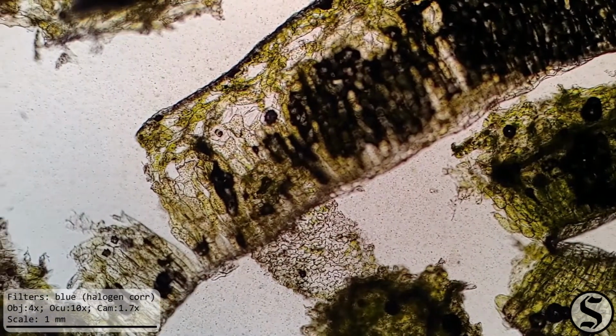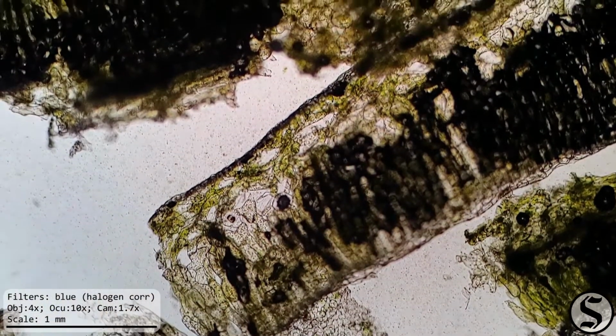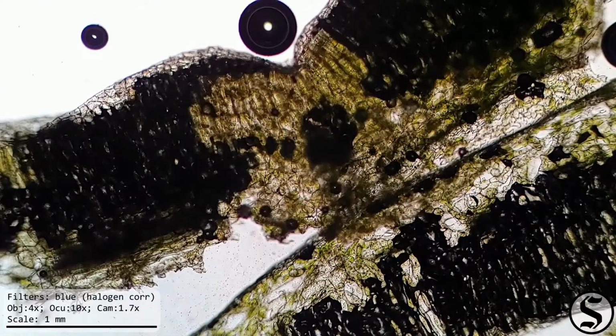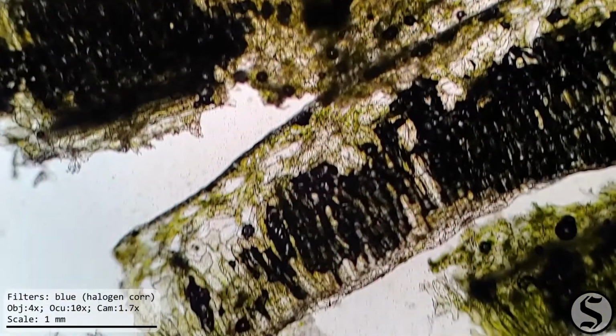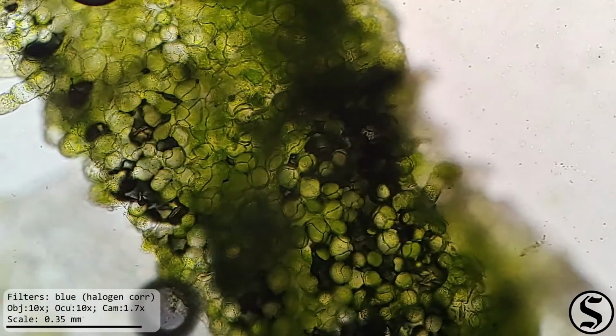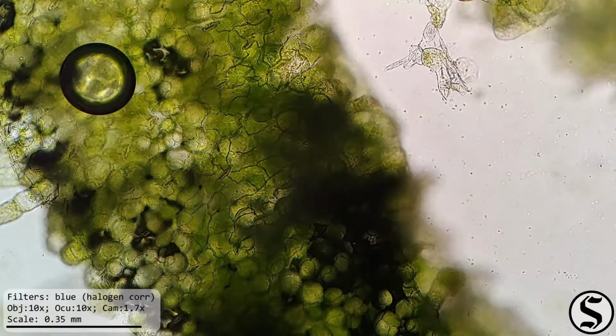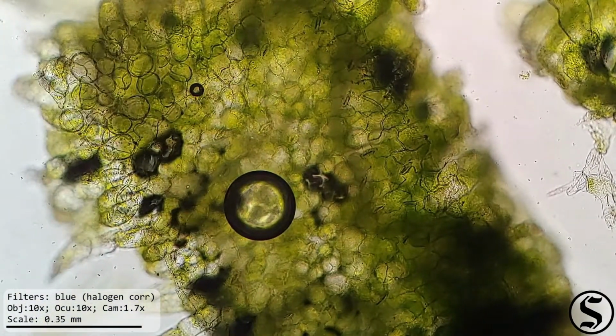As you can see, I've got quite a collection of spinach slices in here, and I don't know yet which ones are facing the right direction. I see some with long-looking cells and some with round-looking ones, and I presume those are orthogonal to each other. So let's check one of them out first. I think I see some epidermal cells on there. Yep, there's a stoma, multiple stomata.